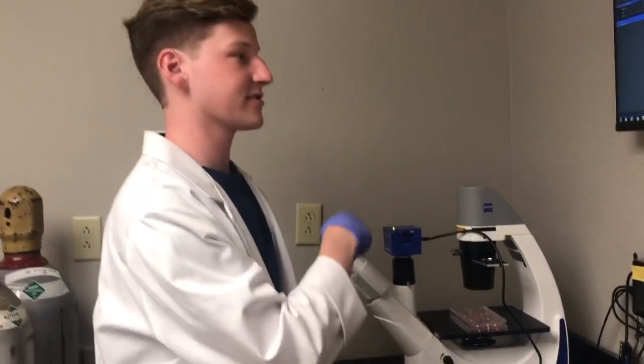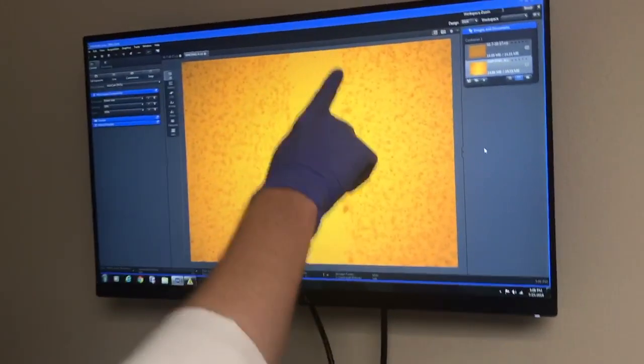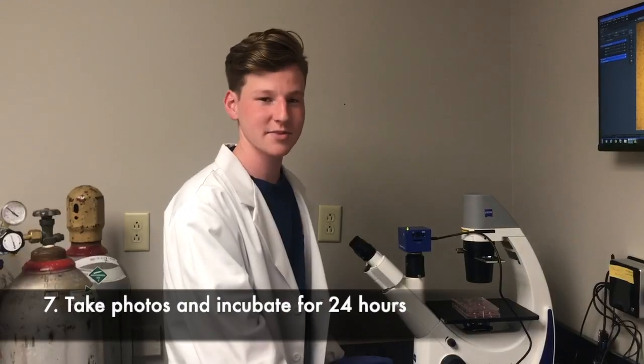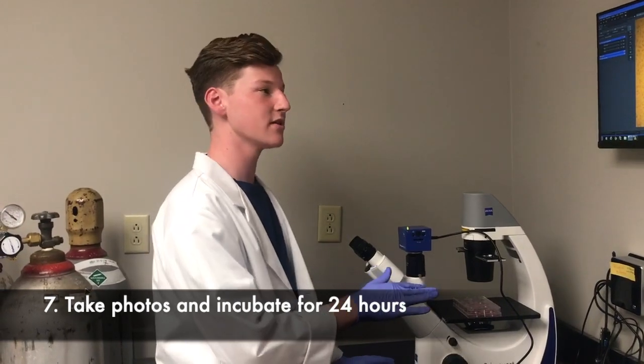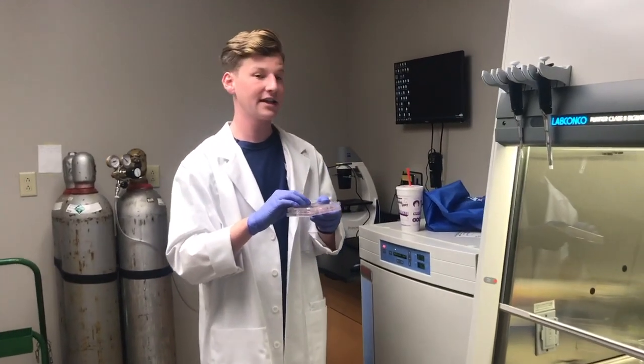Now that you've scratched your plates, go ahead and look under the microscope — it should look similar to this. You want clean borders on the edges and a strip with no cells down the middle. After scratching, go ahead and take pictures so this acts as your time zero, giving you a baseline to measure cell migration against. Then go ahead and incubate them for 24 hours.